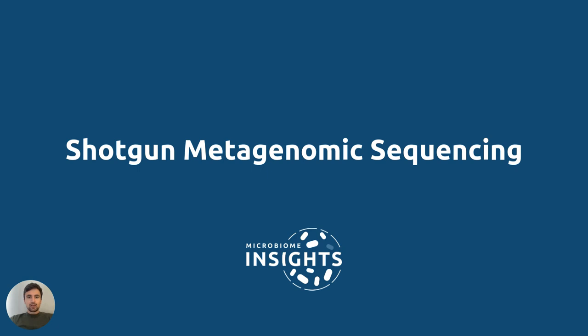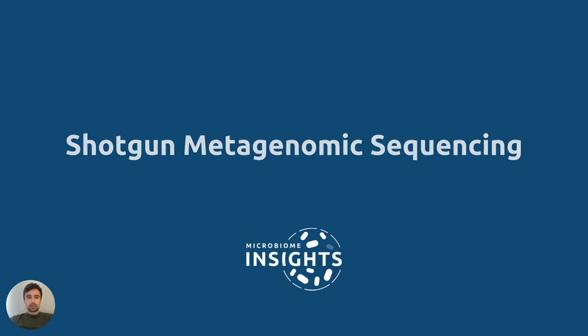In this guide, we will explore this comprehensive DNA sequencing method that helps to simultaneously identify a variety of microbes and their functions within a biological sample. We'll discuss its applications, benefits, and key steps for conducting a successful study using shotgun metagenomic sequencing.